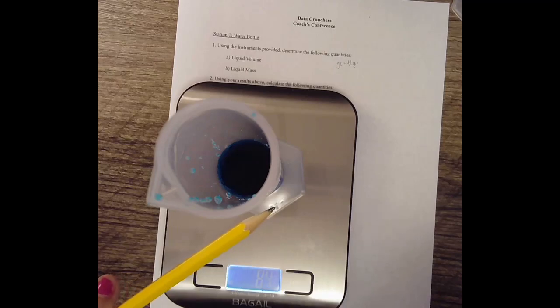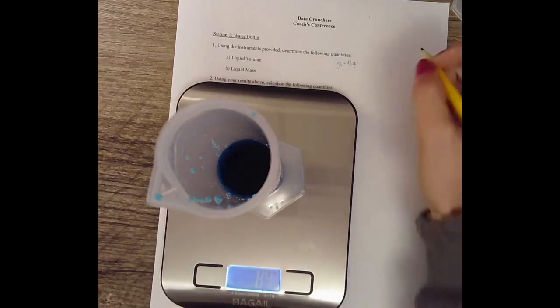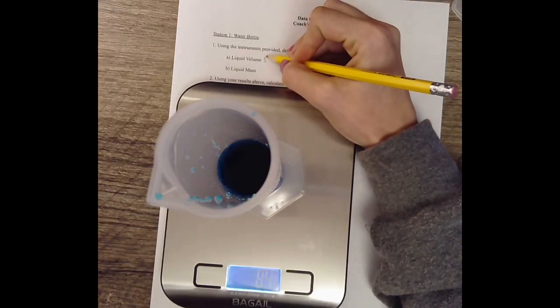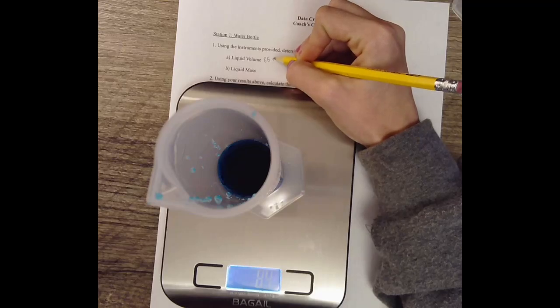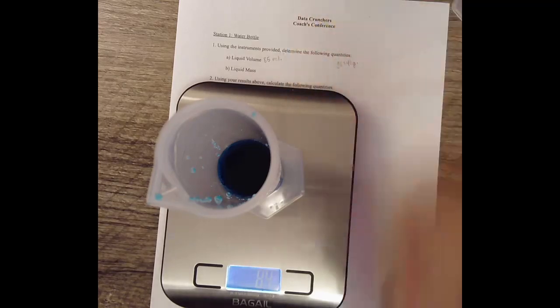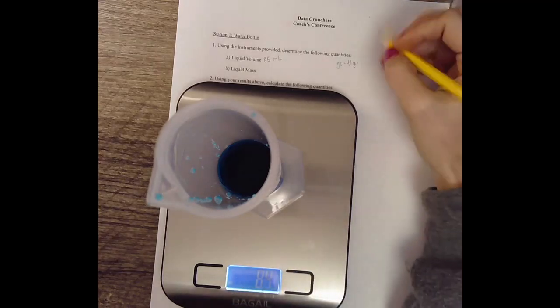So mine goes a little bit above 85, but it doesn't go to 86. So I'm going to keep it at 85 milliliters. That's the liquid volume. That's how much space it's taking up in the graduated cylinder. And the grams is 84 grams.